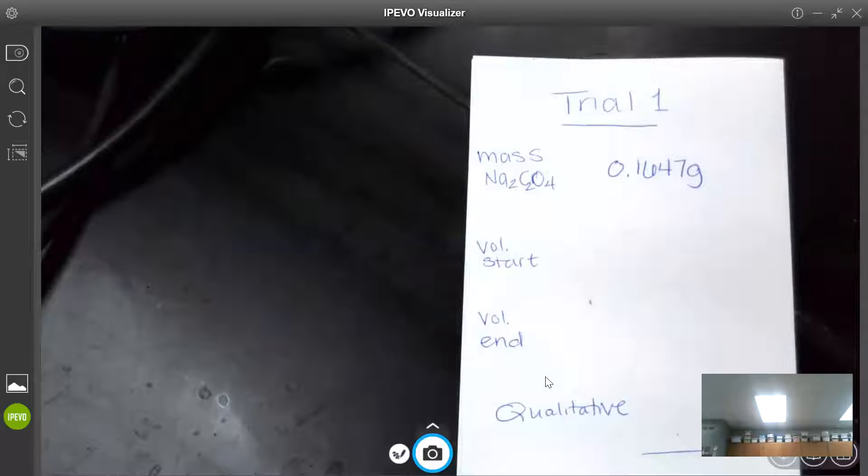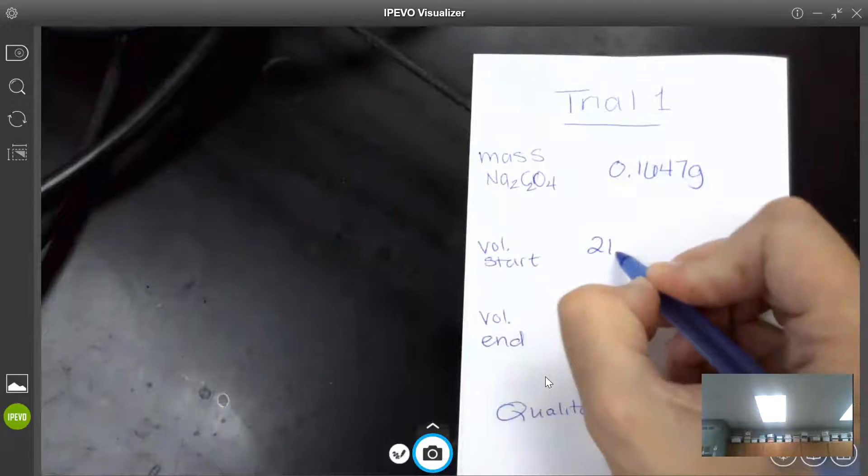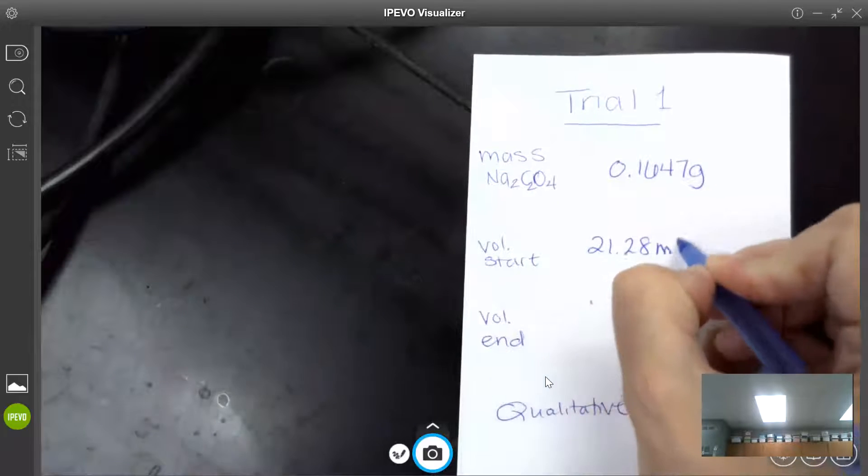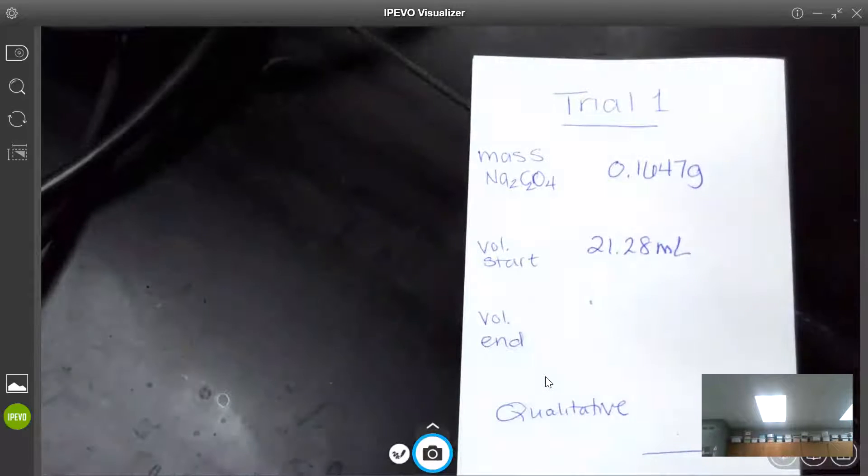So I'm going to stand on a step stool and I'm going to record the meniscus, the volume using the meniscus. So I'm going to say we're starting at 21.28 milliliters. That's my starting volume.